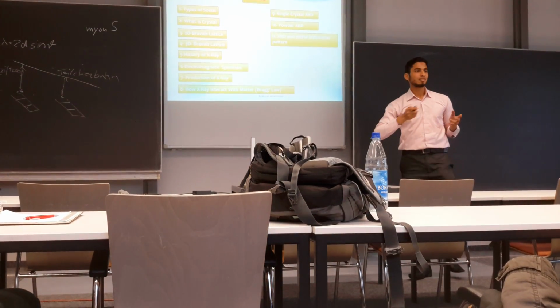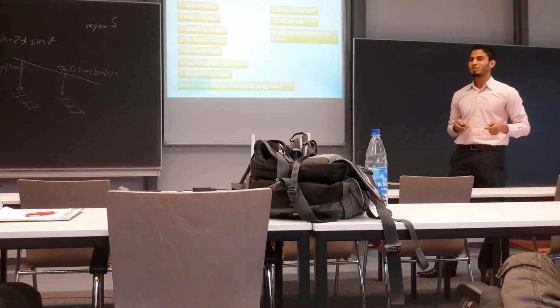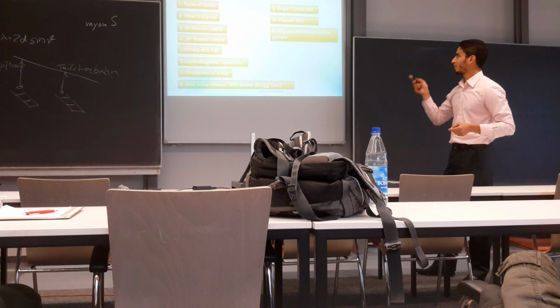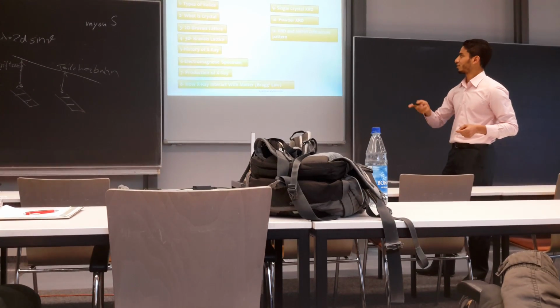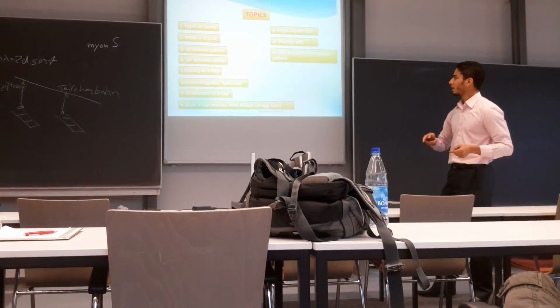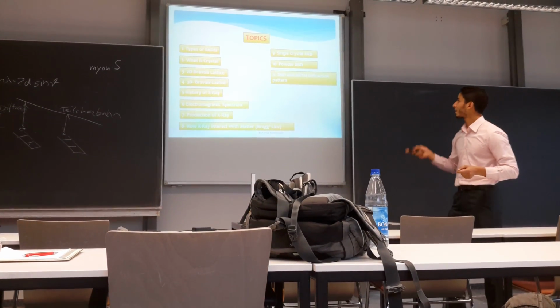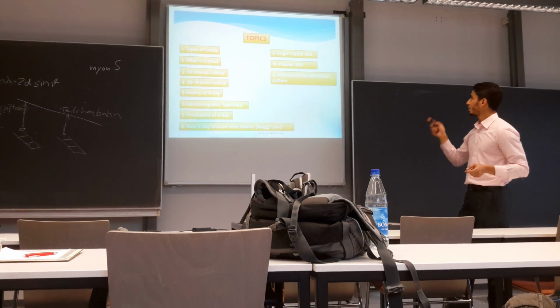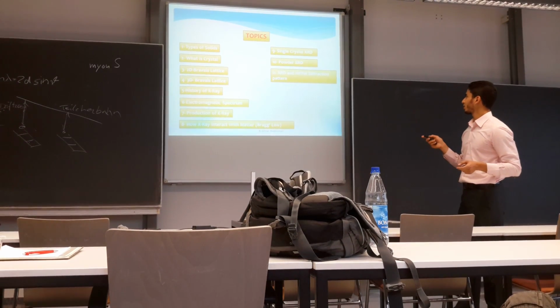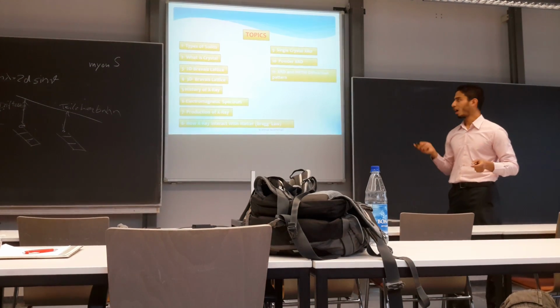In order to be familiar with X-ray diffraction, you should be familiar with some topics in crystallography. So I would like to start with some definitions related to crystallography, such as the types of solids, what are crystals, Bravais lattice. Then I will shift to the history of X-ray diffraction, spectra, production of X-ray, how X-ray interacts with matter, single crystal X-ray diffraction, powder X-ray diffraction, and finally how to match XRD with diffraction patterns from a high resolution camera.